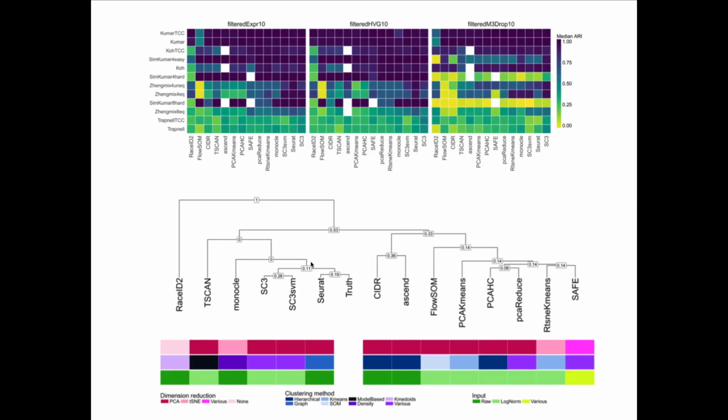And in this case, what they call Seurat is this graph clustering with, I think it was the Louvain algorithm, just based on PCA, which is now the standard in Seurat. So there were a lot of papers with fancy single cell clustering methods that are not being used so much anymore, from what I can see.